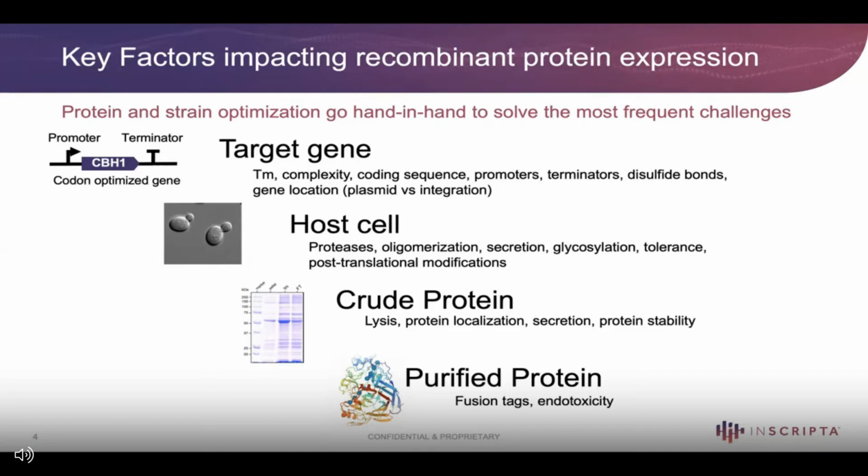And then there's the next step of thinking about what host cell do I want to use. As I mentioned, a go-to host cell within the community is, of course, B strains, like BL21, for example. That might be your first go-to cell. You might want to express it due to chaperones, or due to translation, due to glycosylation.